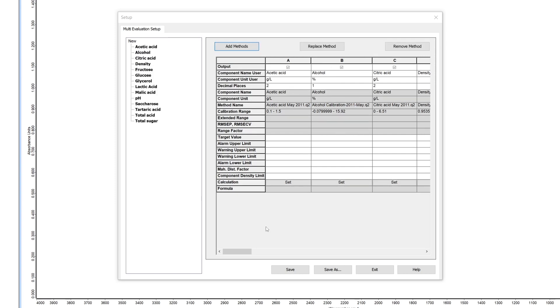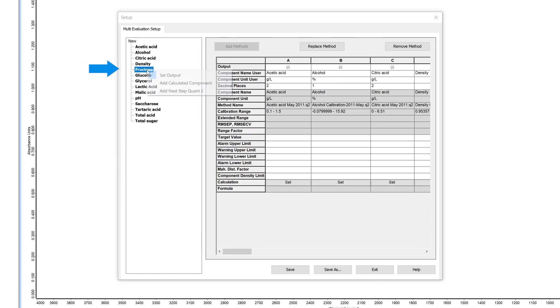Then left-click on the component for which you want to add a next step QUANT2 analyzes, in our example Fructose, and click on add next step QUANT2.